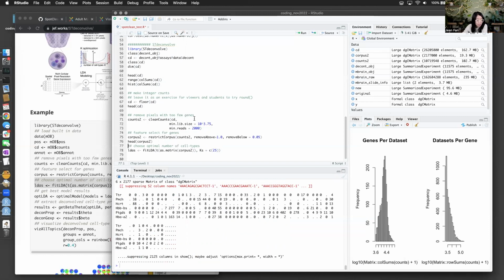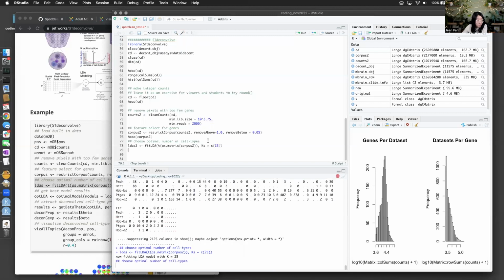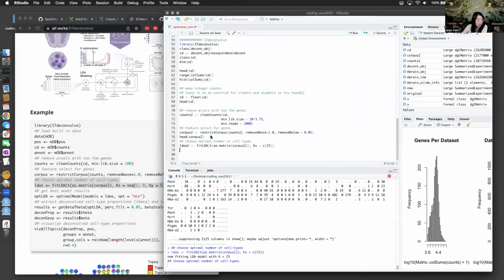Yeah, and let's see then. Why don't I put the LDA modeling here too? Oh shoot, should have named it 2. Just so that we can compare. And well, then let's see. Yeah, so now we have our 2 sets of LDA modeling running.